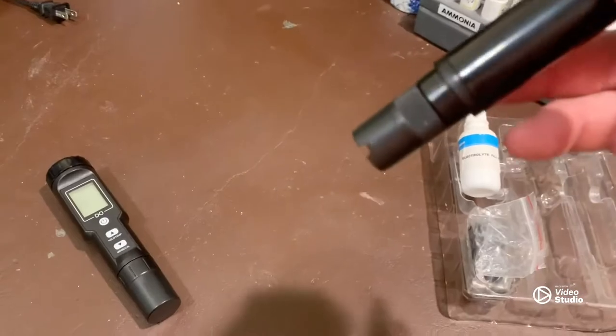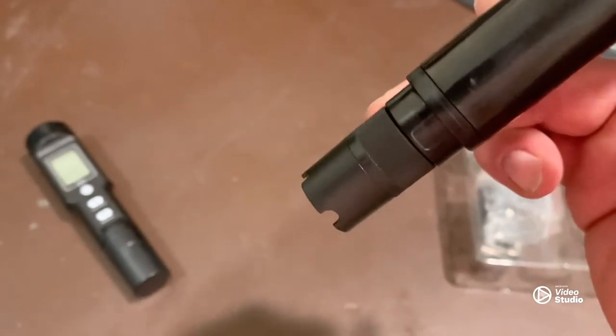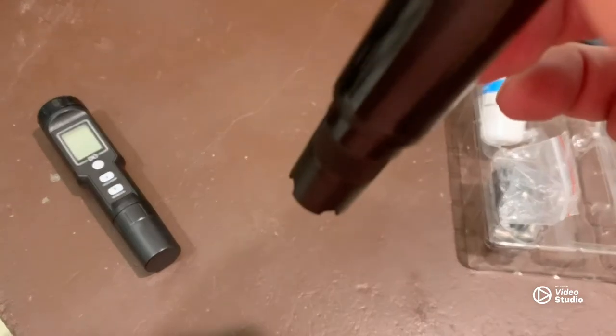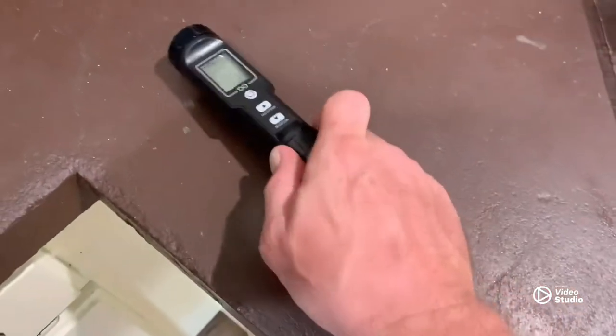I got it screwed back on. When you're screwing it on, make sure to only be touching that knurled part — do not put your finger on the bottom, only touching that knurled part.